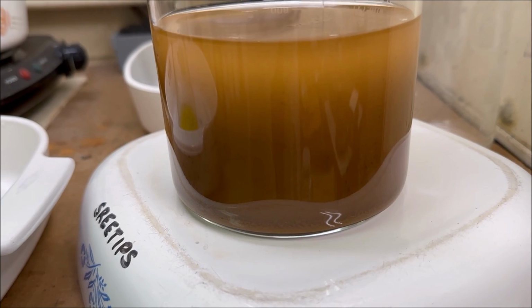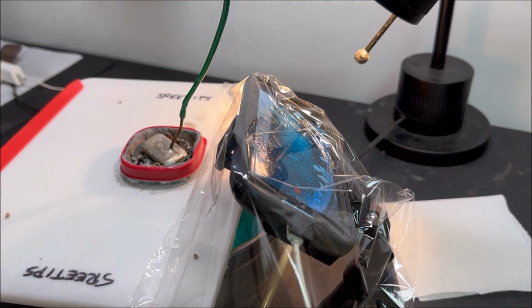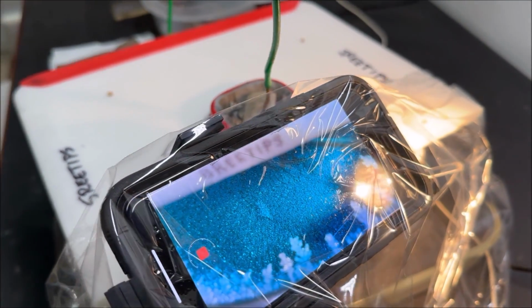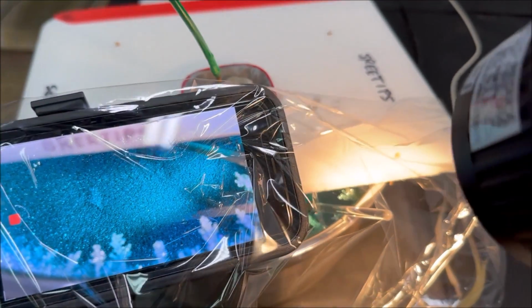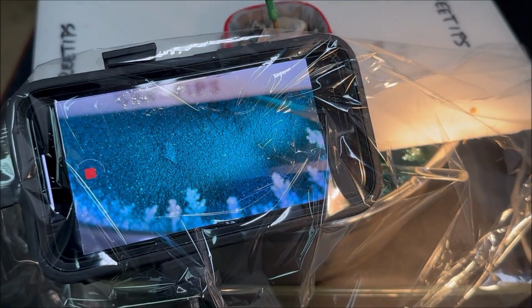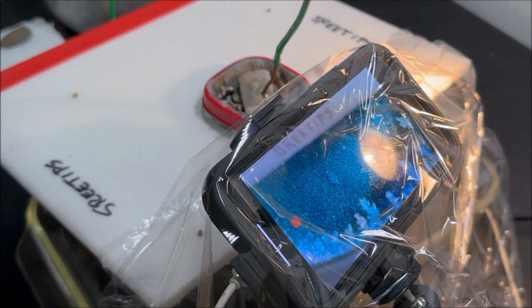While I'm waiting for this gold to settle, let's go over here, take a look at our time-lapse experiment. This has been running about 4 days now, and we're starting to see some decent crystals growing down in there. So we'll publish this later on, probably next week. Should be about a 10-day time lapse of the electrolytic silver cell crystal growth down in the silver cell.